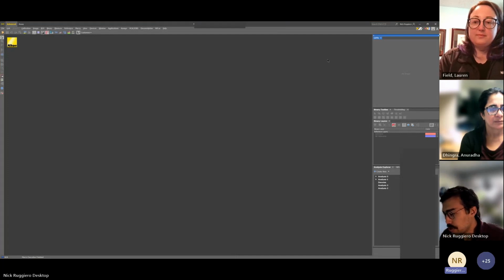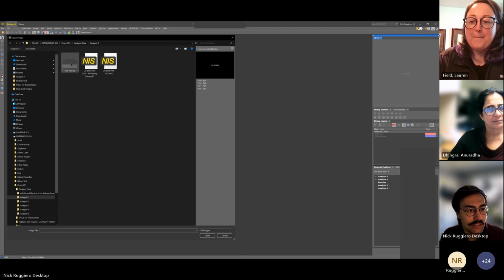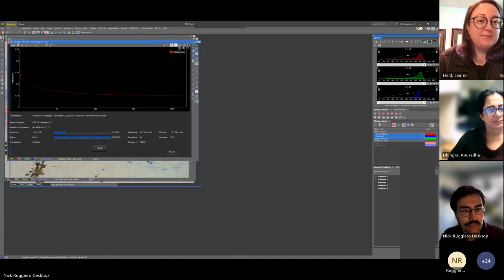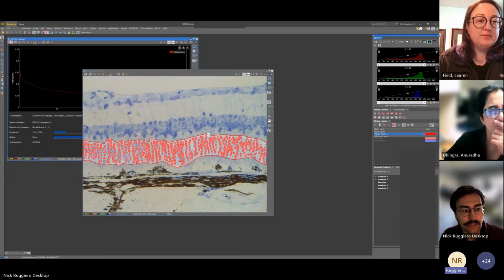All right, so we will now go from analysis 5 to analysis 1. I'll pull those images up here. This is the one that I want to start with.